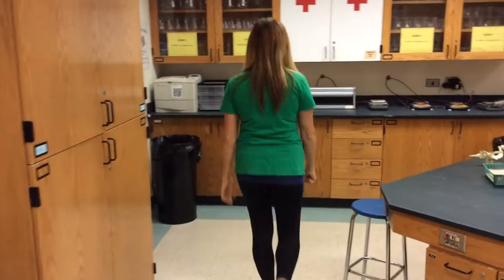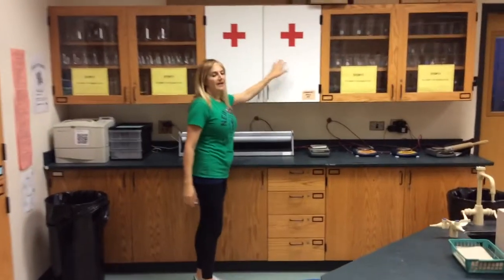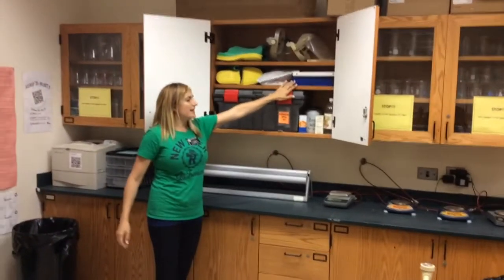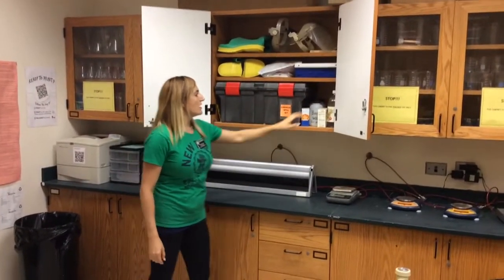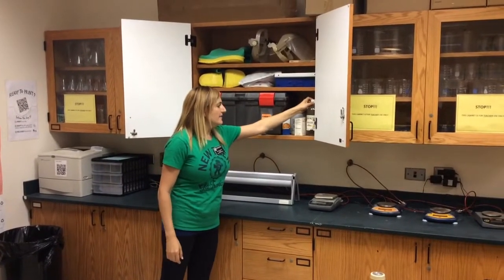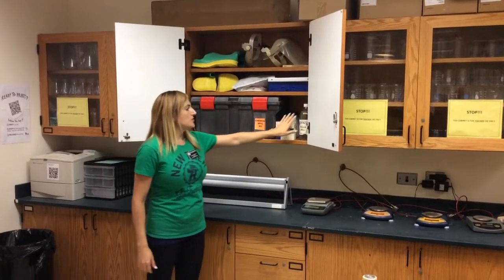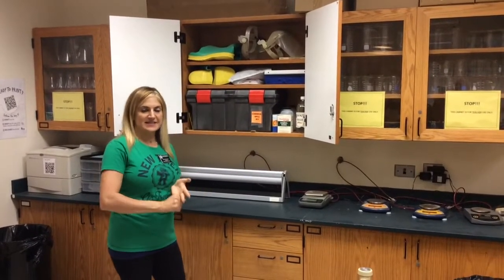All right, over here is the first aid kit. This is where you'll find a lot of safety equipment like Band-Aids. Also in here are a safe acid, vinegar, and a safe base, baking soda. This is what we would use to clean up acid and base spills.